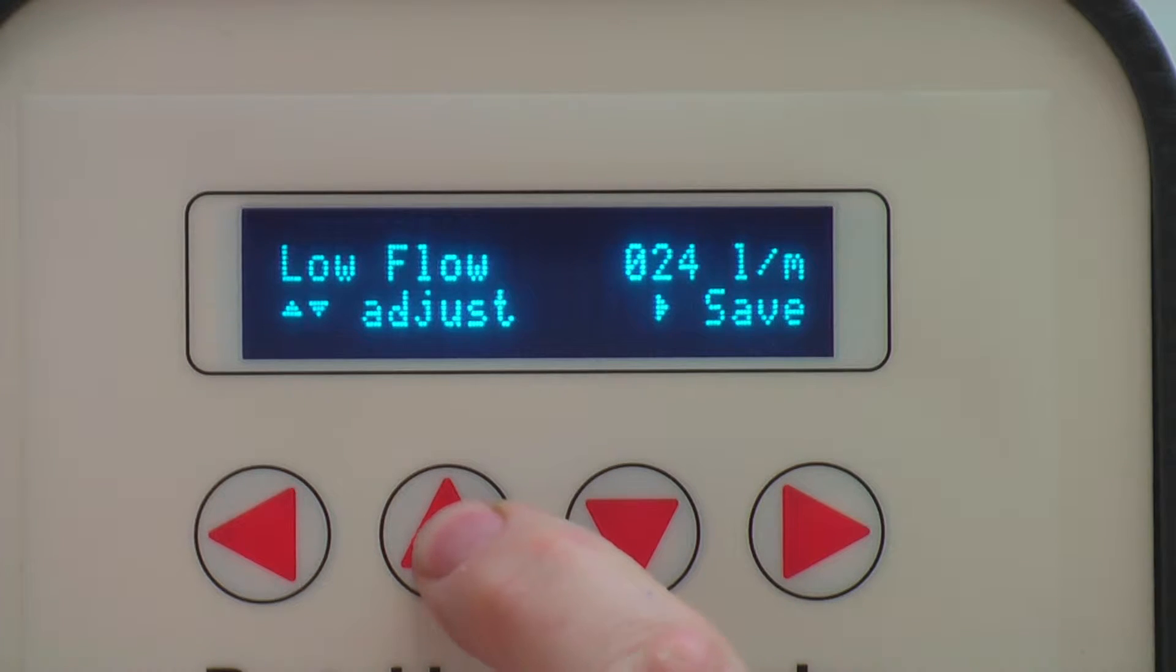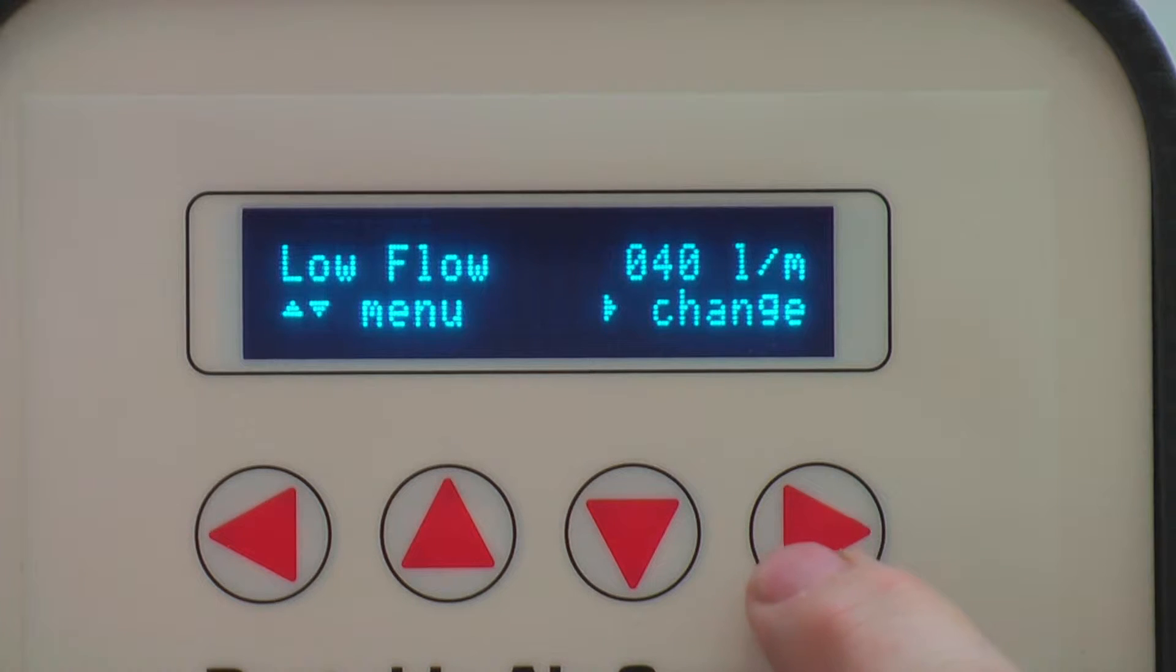Pressing down will take you to the low flow configuration. Low flow is the lowest flow allowed before an alarm is triggered and the sample is stopped. Press right to access the settings. Pressing up or down will allow you to increase or decrease your low flow set point.